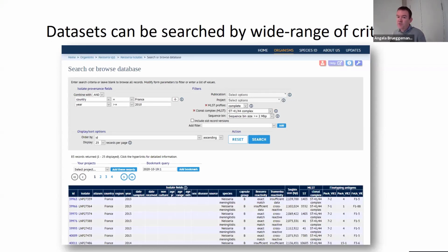Or there are these filters which are built in. There's some which come predefined. So for instance, like the publications. So this gives you a searchable list of publications, and you can search that based on author directly from within this filter. Your project list, and you can select multiple projects. It's not just a single item.